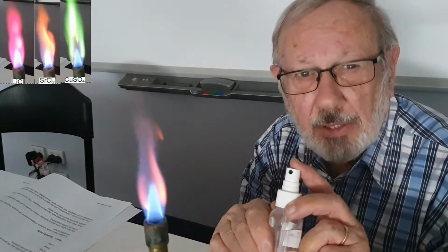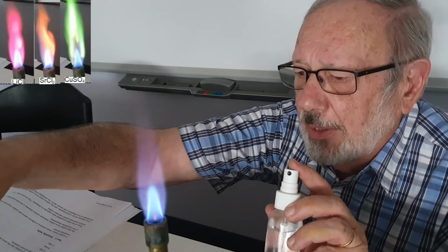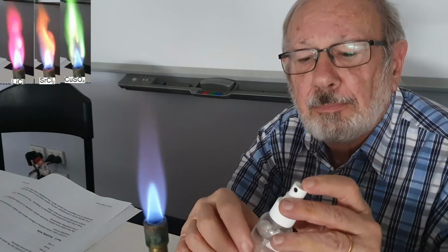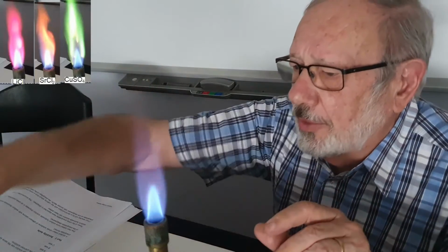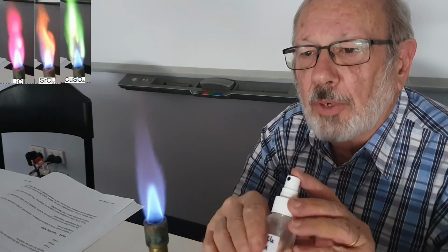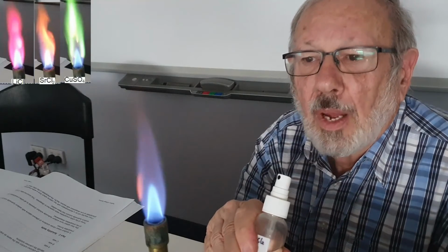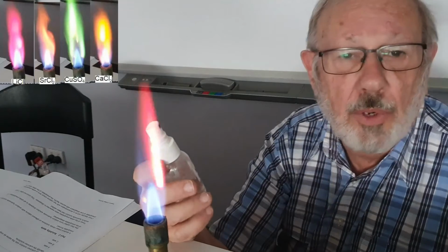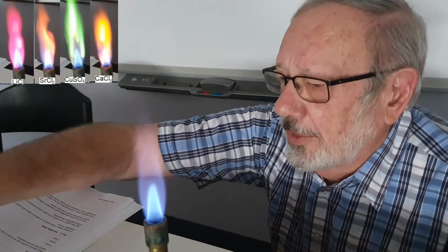So it looks a bit tricky, doesn't it, to distinguish between strontium chloride and calcium chloride. So bright orange, and this one, strontium chloride, slightly redder. Okay, our strontium chloride seems to be slightly redder in colour than calcium chloride.